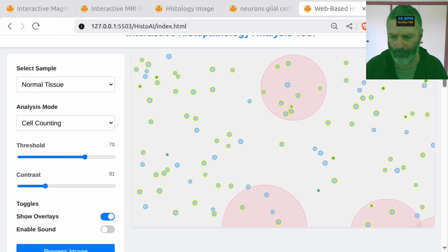2. Ensure the demo mode functions correctly. The demo should automatically cycle through the different analysis modes and parameters, demonstrating the on-the-fly processing of the image. This should clearly display the effects of changing the analysis type and the threshold setting. Thank you for your assistance.